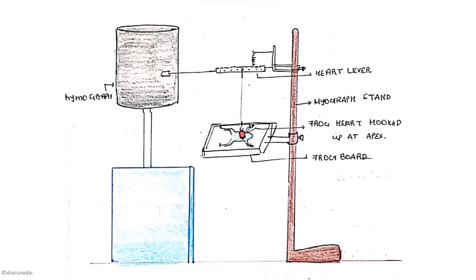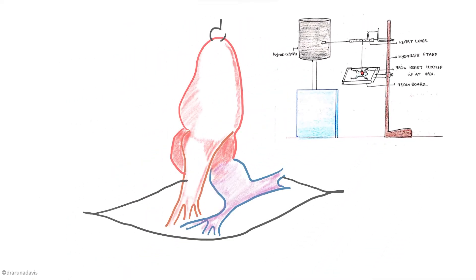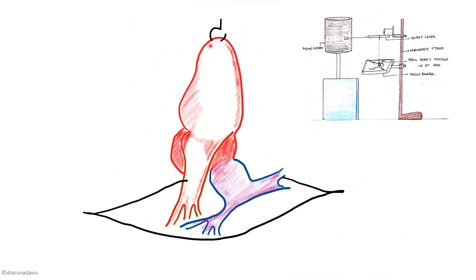This is the experimental setup while we record the normal cardiogram. Here you can see a frog — we have dissected out the heart and suspended it on a Starling's heart lever. If you magnify this view, you can see that the heart is held in an upside-down position. That is why when the heart contracts, we record it as a downstroke, because it will pull the lever downwards.